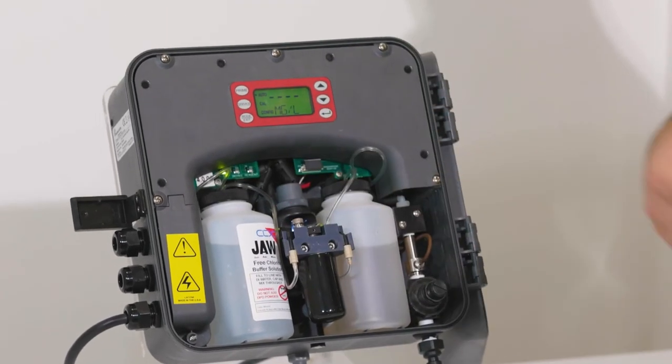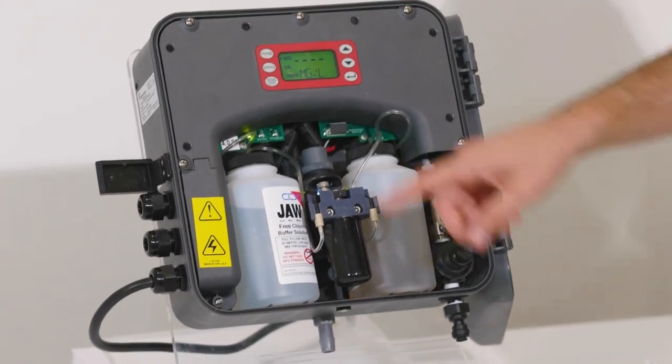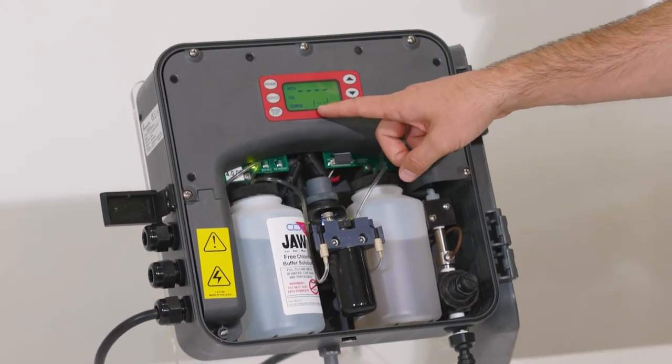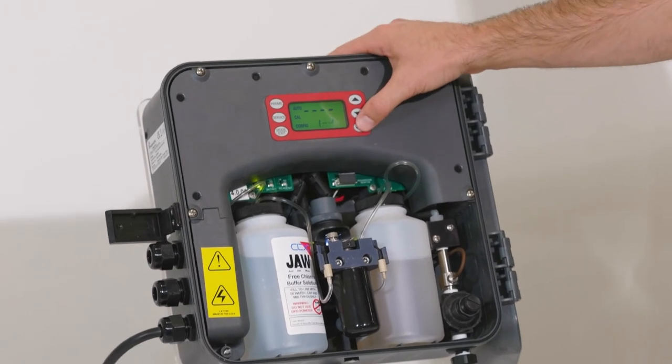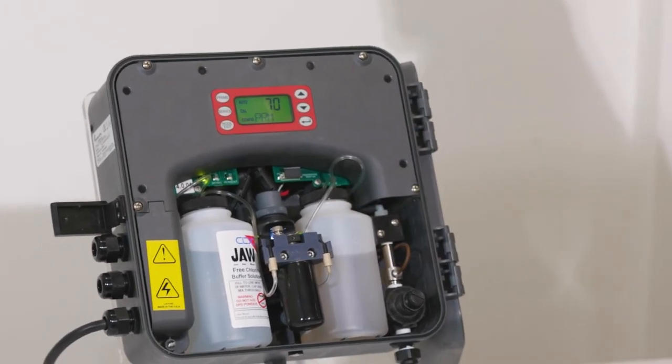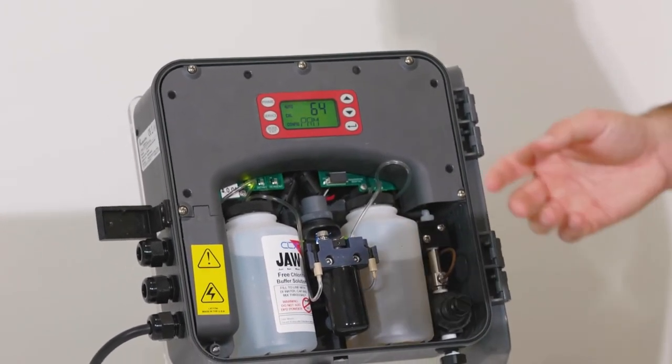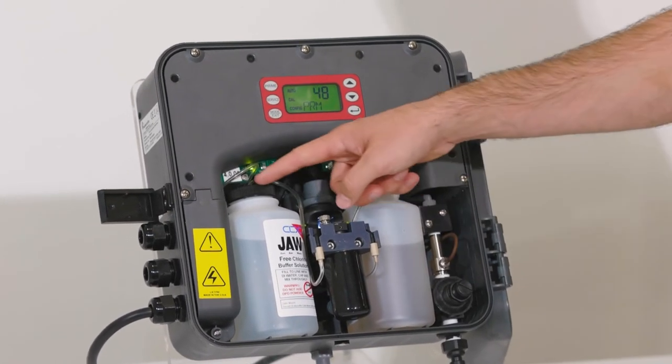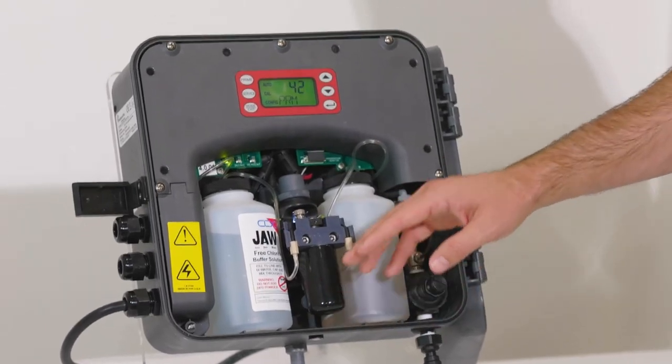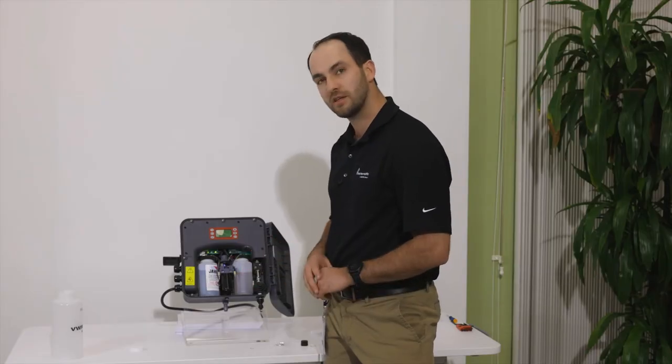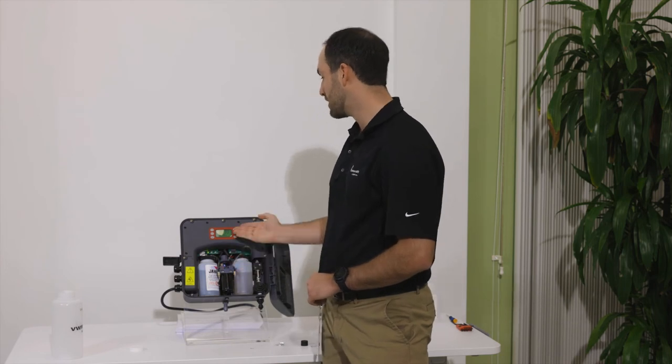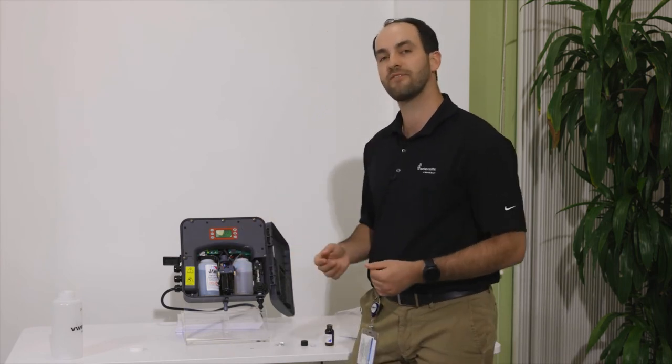Once you have the new reagents in, we need to prime the new reagent lines. So we'll hit prime, upper left corner. It will prompt us to hit the enter button. So we'll hit the enter button. And that will prime the pump 75 times. While the pump is priming, what we want to look for is we want to make sure that we see air bubbles coming through these lines here. We want to make sure that we see reagent being pushed into the optical block there. And you'll see that reagent moving through the reagent pump will pump 75 times.